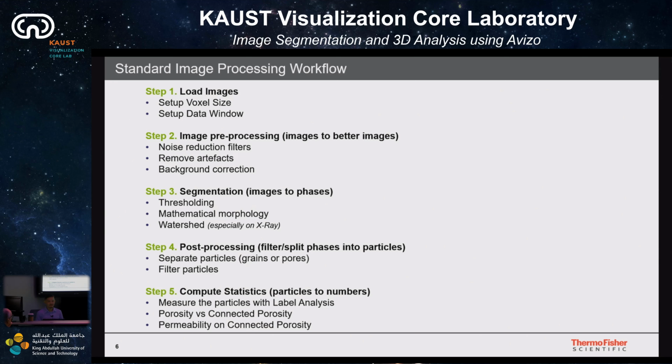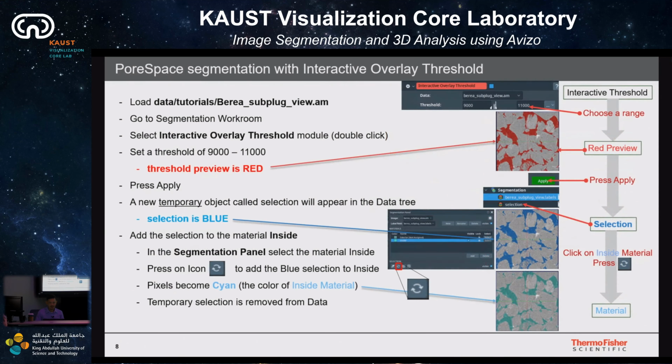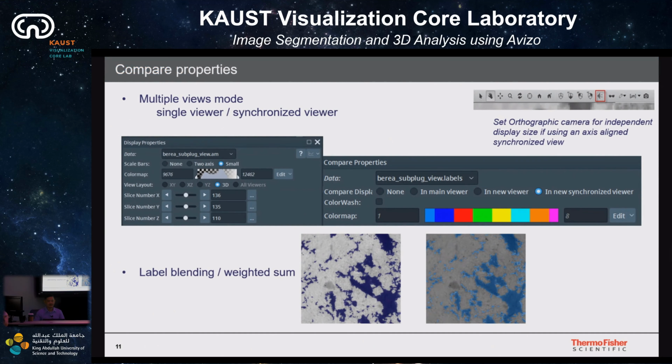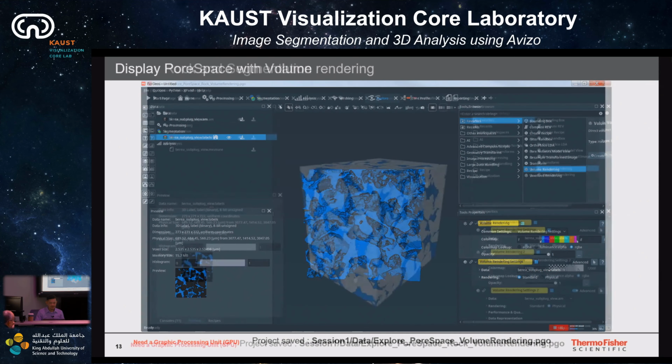And if people already work with Avizo, you will see that it's much better, more streamlined in Avizo than PerGeos. For example, you can see here when you load data and go to different workrooms in PerGeos, it's a bit of going back and forth. That's why we want to streamline and bring everything back to one dashboard. So we will go through it later in the real practical.